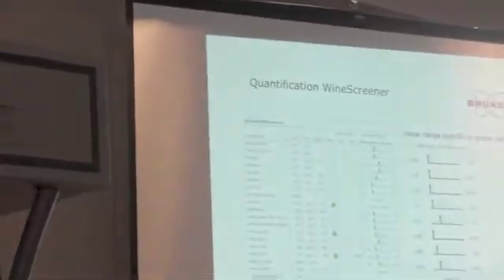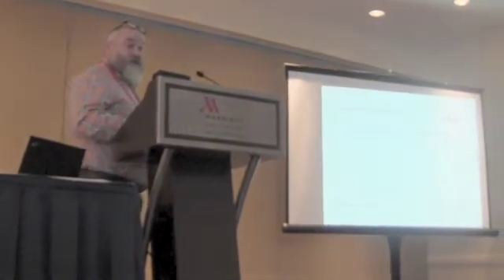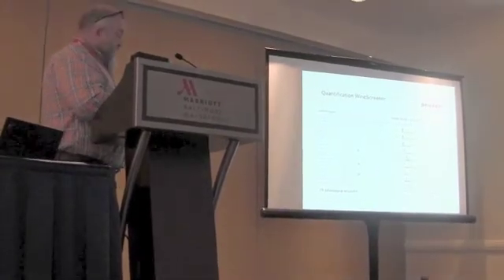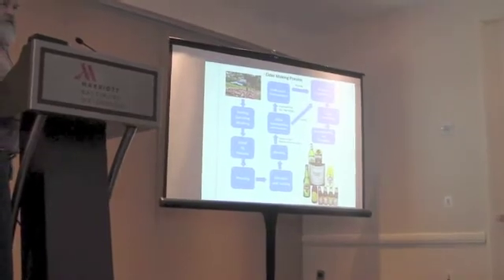It seems like massive overkill, but you get a lot of information out of this thing, and you can get it relatively cheaply. At the end of the day, you get all this detailed information that you just add up and you spit out a nutrition label. So if you charge somebody $200 to get all this information, you can also turn around and say, I'll give you a nutrition label as well, batch by batch if you want. Because it's just right there. All you do in an Excel spreadsheet is add it all up.